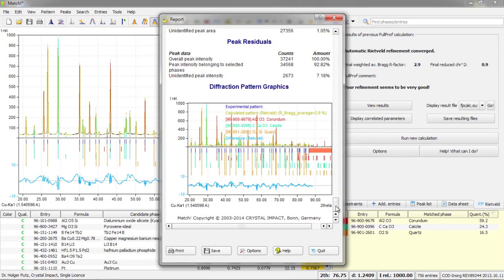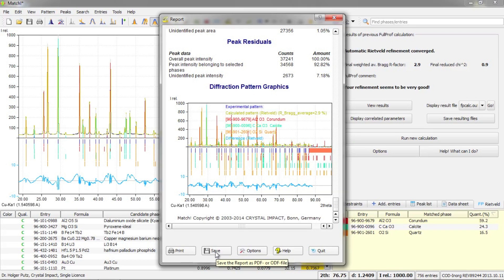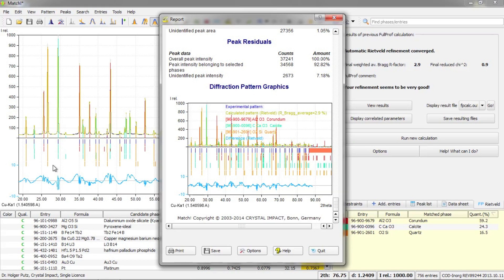Now we are finished. We have our report, and we can print or save it just as you like. We are done now at this point. Have a nice day. Bye.